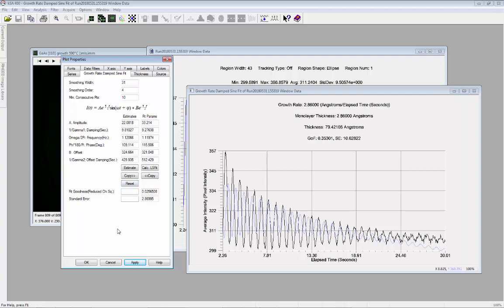As you can see, KSA 400's new and improved damped sine fit can be a very powerful addition to your in-situ metrology toolbox. Thank you for your interest. Please visit our website for more information.